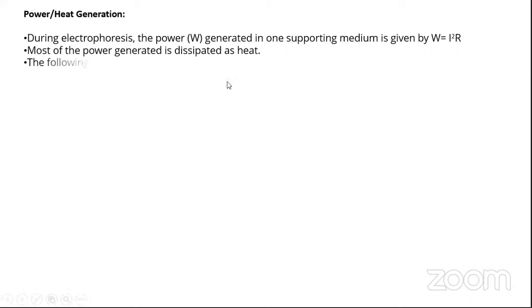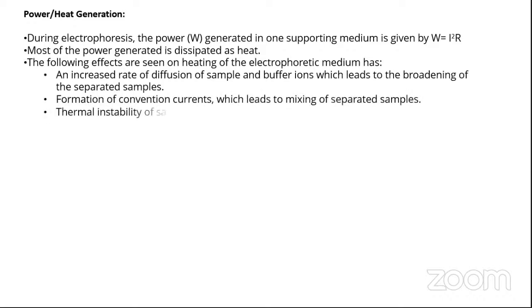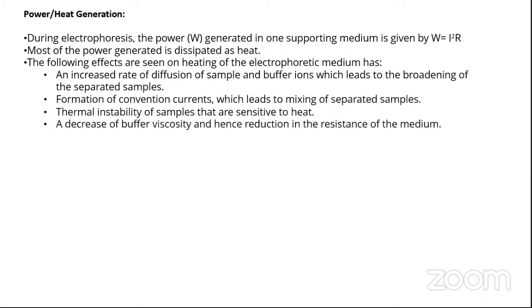When there is an increase in heat, there also happens evaporation of the medium liquid, and that increases the concentration of buffer ions in the solution.